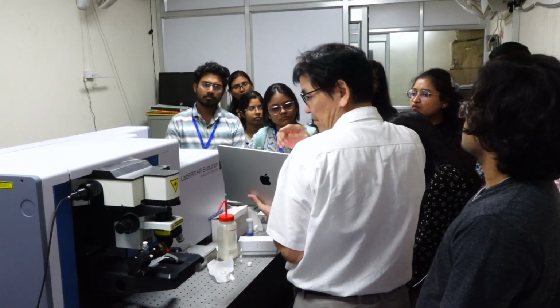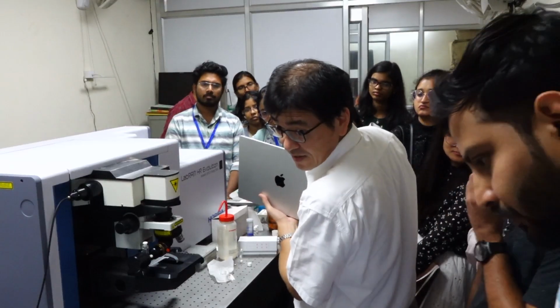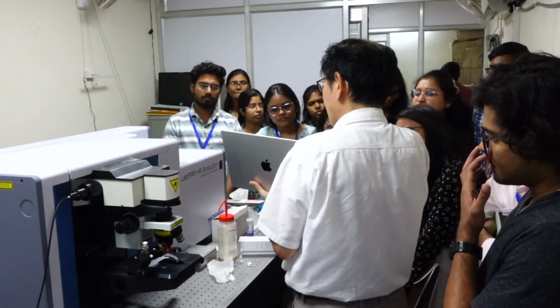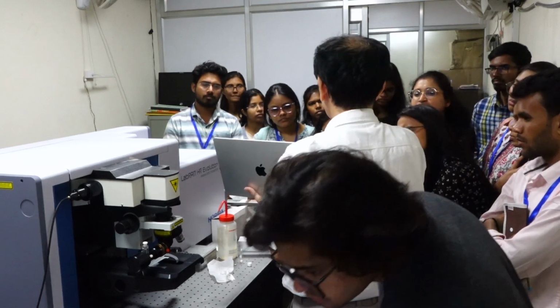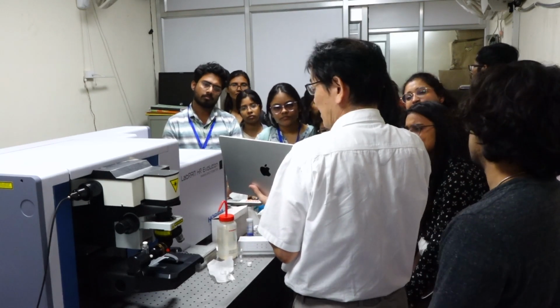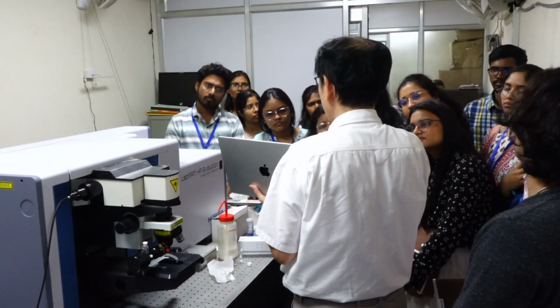So now the measurement time is 6 seconds multiplied by 4 times, so 24 seconds, nearly 30 seconds, and we get this data. We need to spend more time to get better data.